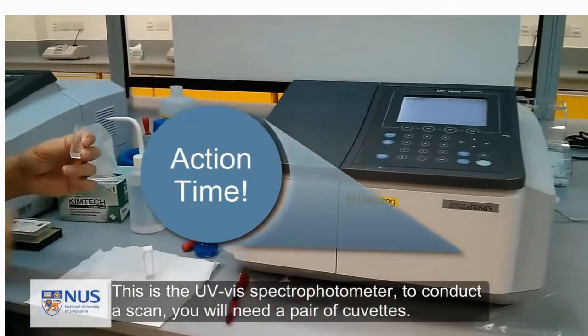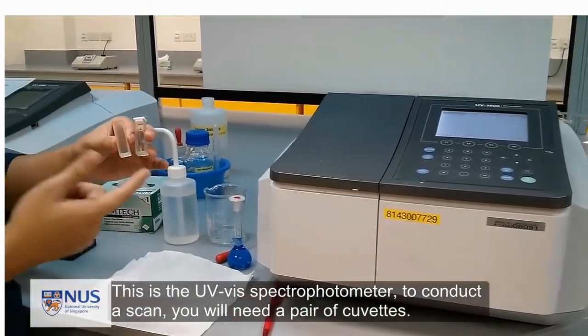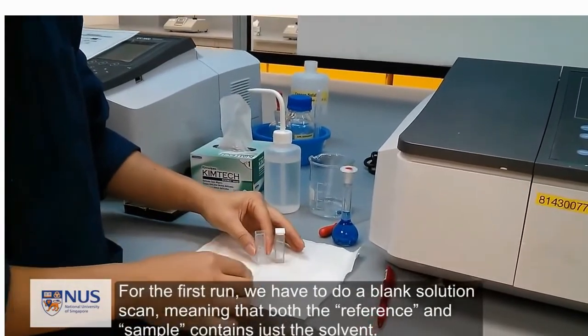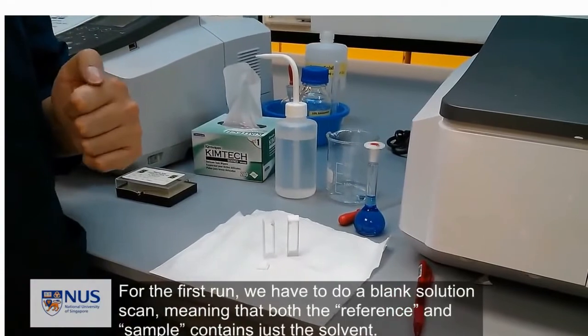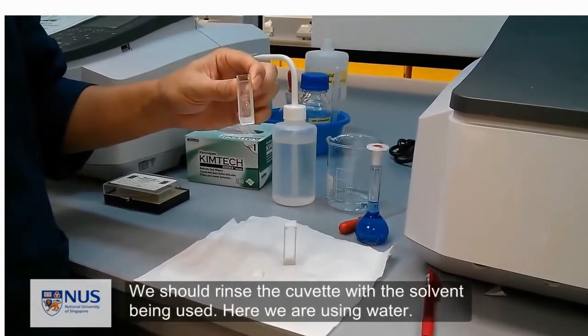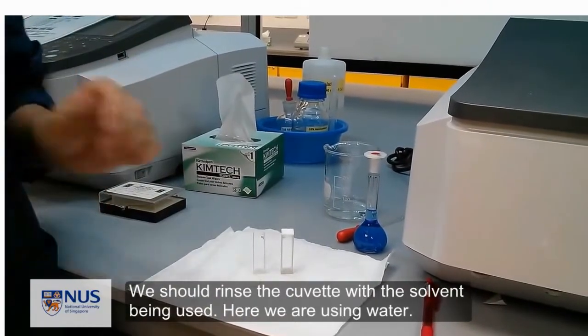This is the UV visible spectrophotometer. To conduct a scan, you will need a pair of cuvettes. For the first run, we have to do a blank solution scan and auto-zeroing, meaning that both the reference and the sample contain just the solvent. We should rinse the cuvettes with the solvent being used. Here we are using water.